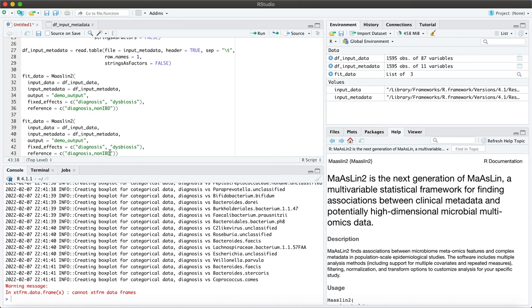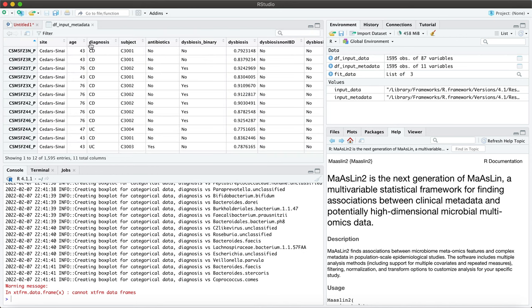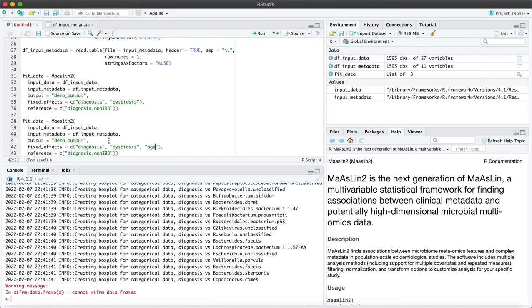So first, as you've seen, you can include multiple covariates and you would include those under fixed effects. So I can include age for example. Age was a variable in our metadata so that's what I have included here. You can also specify the analysis method.